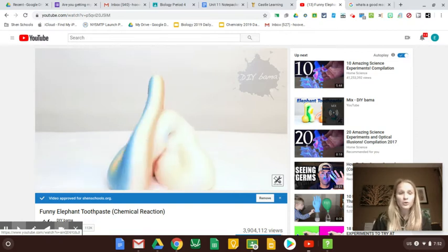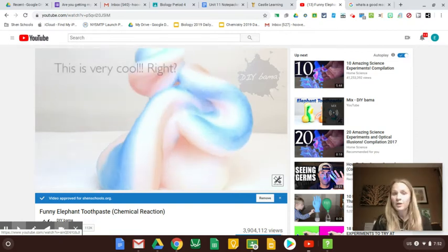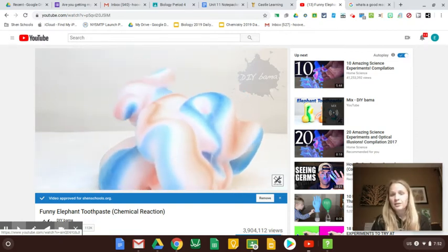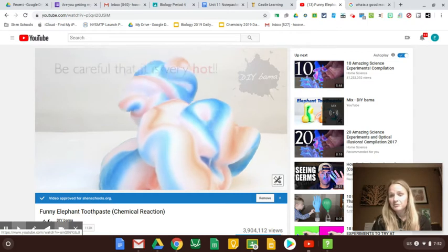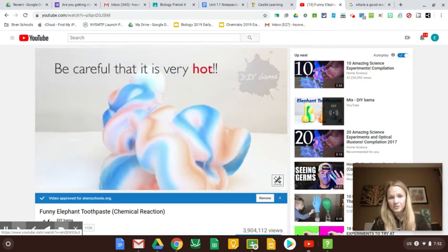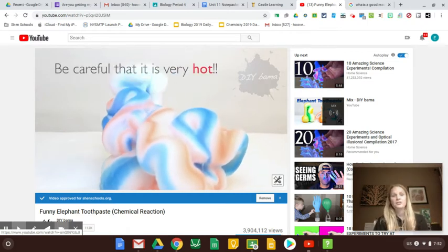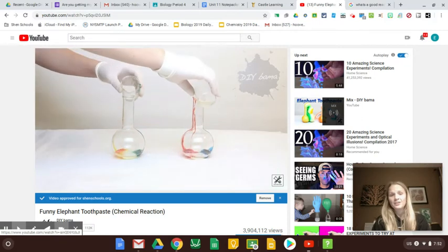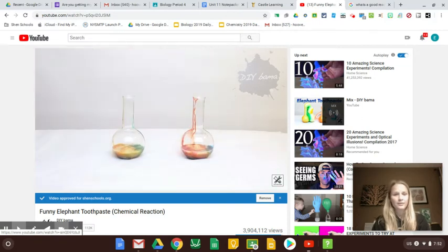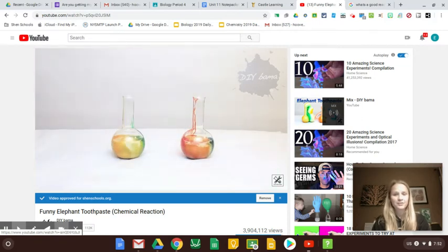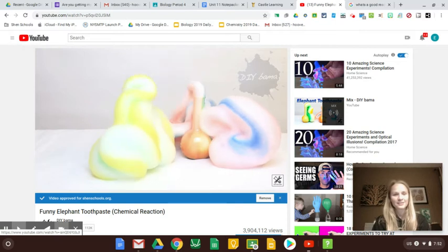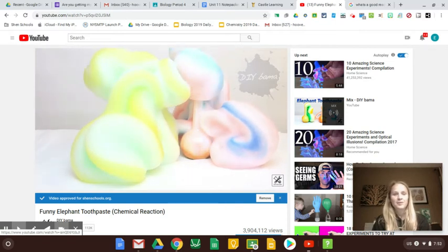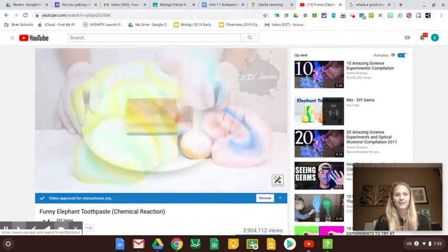You might see it as two molar instead of one molar. A molarity of two instead of one is more concentrated, so you should have a better reaction. That foam is actually hot — I would have let you touch it in the classroom; it does feel hot and it's kind of fun. And it makes a big mess — I wish we could do it together.